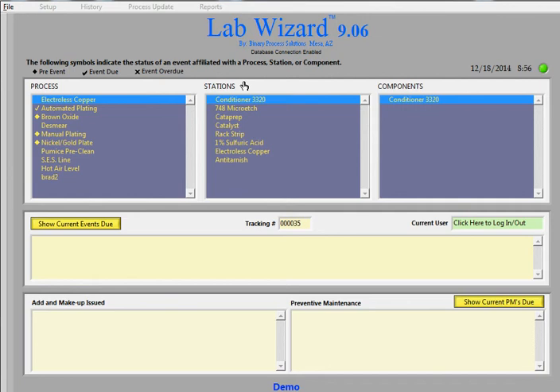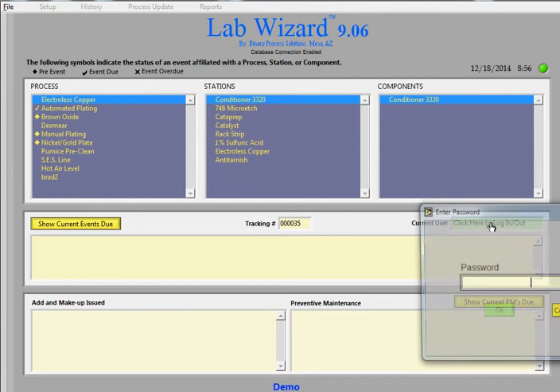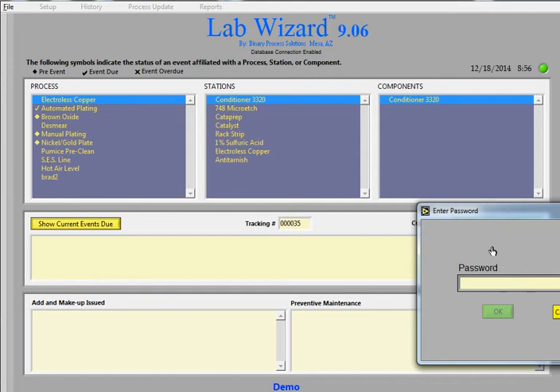Every technician that uses the software will need to log in. That way there's accountability and you're able to see exactly which technicians are doing what kind of work.